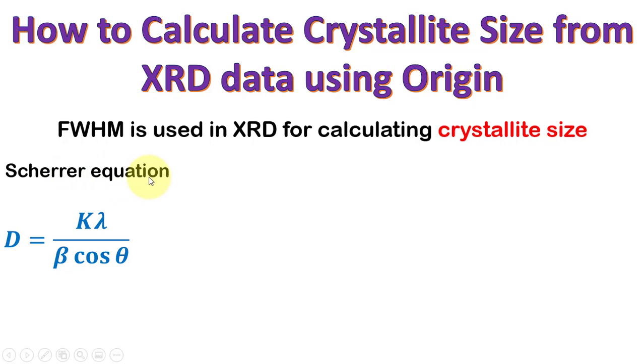We will use the Scherrer equation: crystallite size equals K lambda divided by beta cos theta. This equation is valid for crystallite size up to 200 nanometers.